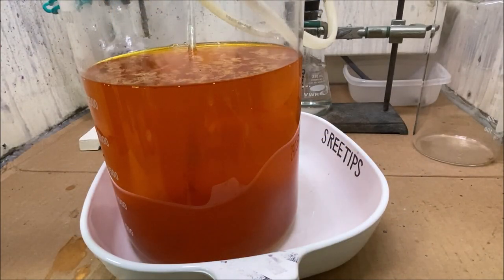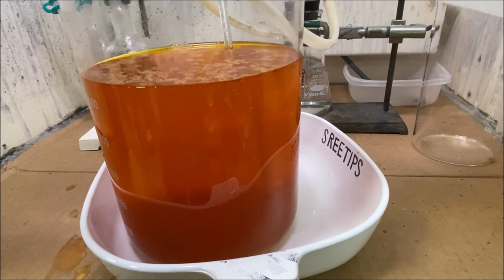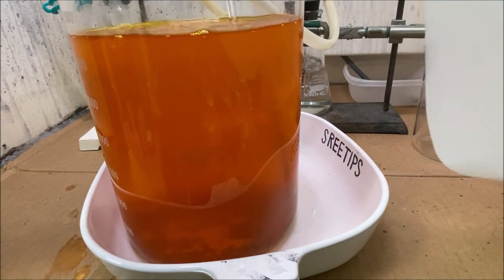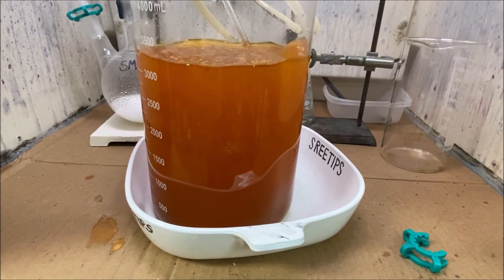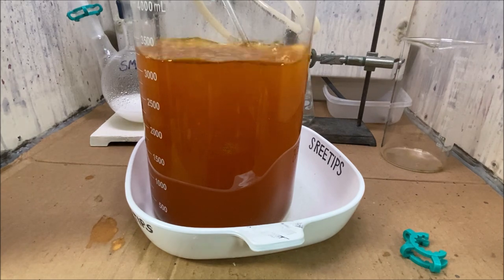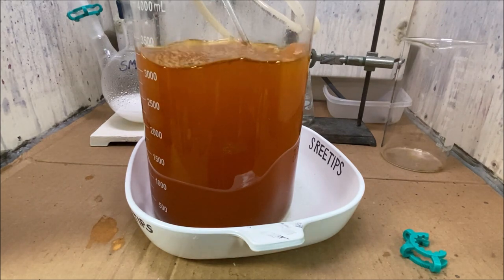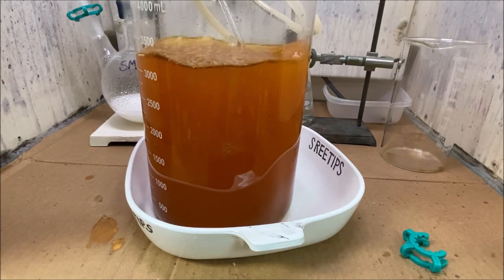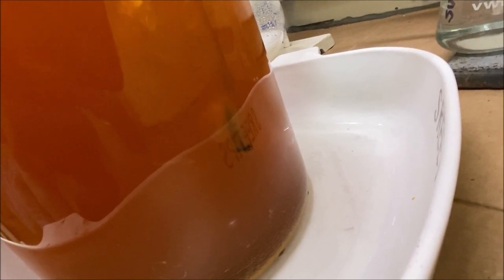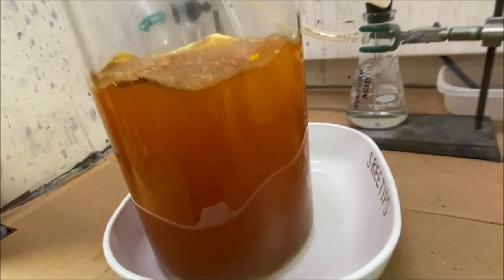I'm going to dilute it a little bit more with some distilled water. I had to add some water. I forgot to add water to make a slurry. And now we've got a decent flow of gas. And I think we're going to be okay now. It was plugging up the tube. Tube's right there. And I had to clean that out two or three times.